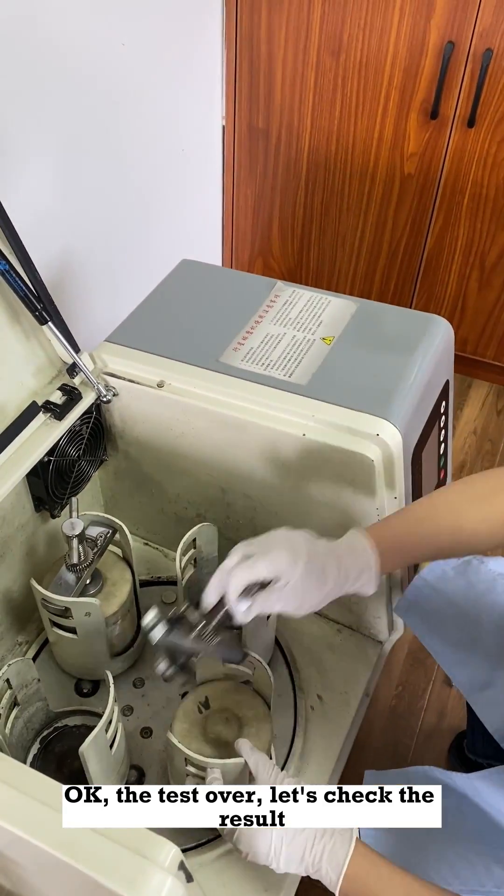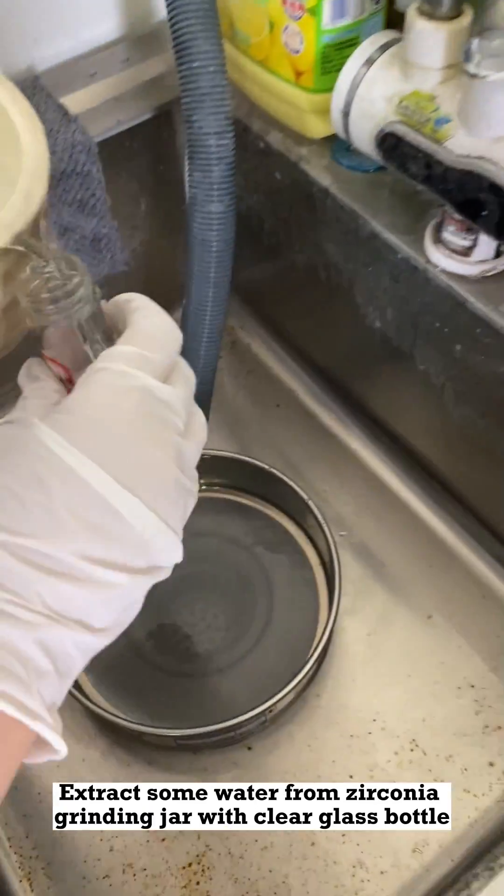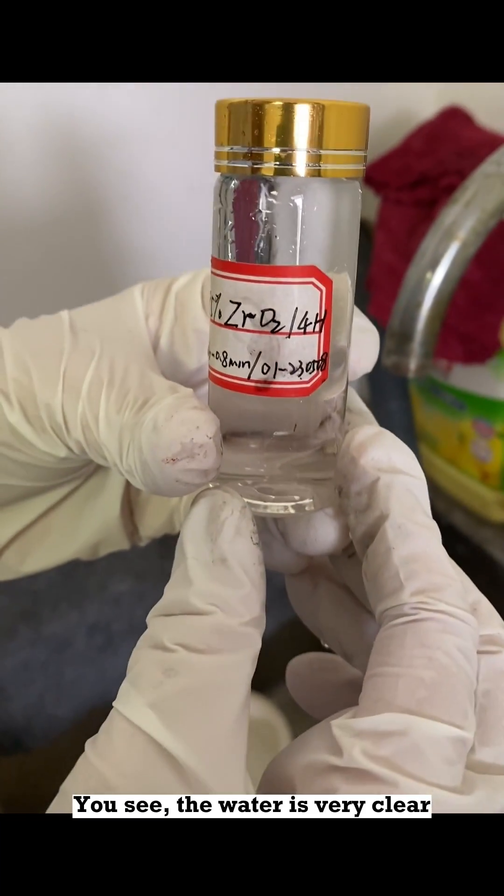4 hours later — the test is over. Let's check the result. Extract some water from the zirconia grinding jar. With a clear glass bottle, you can see the water is very clear.